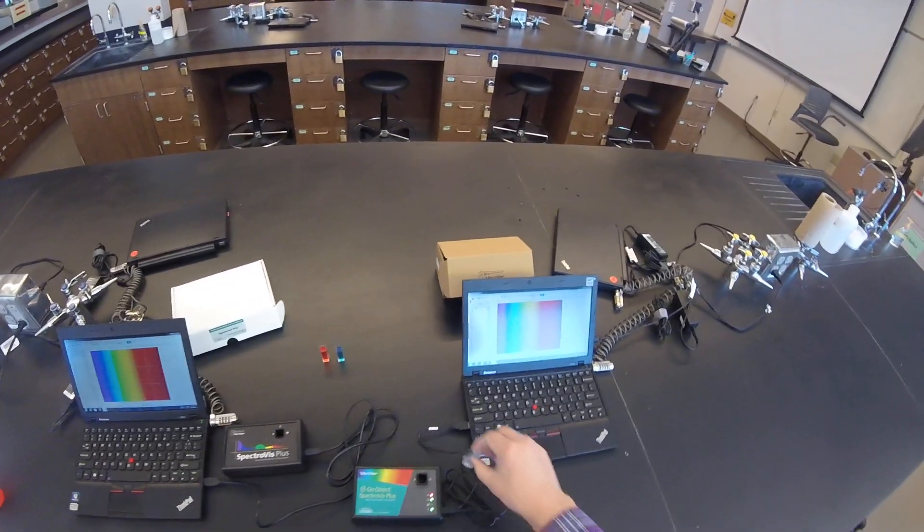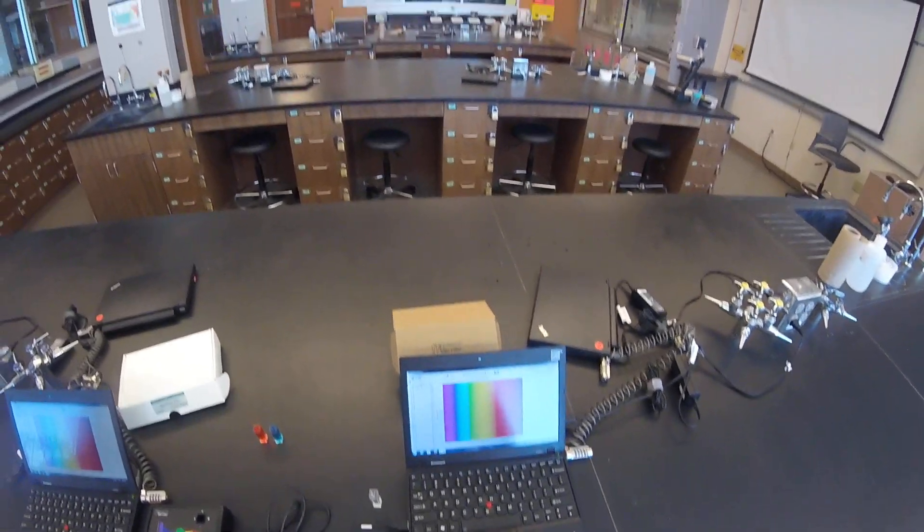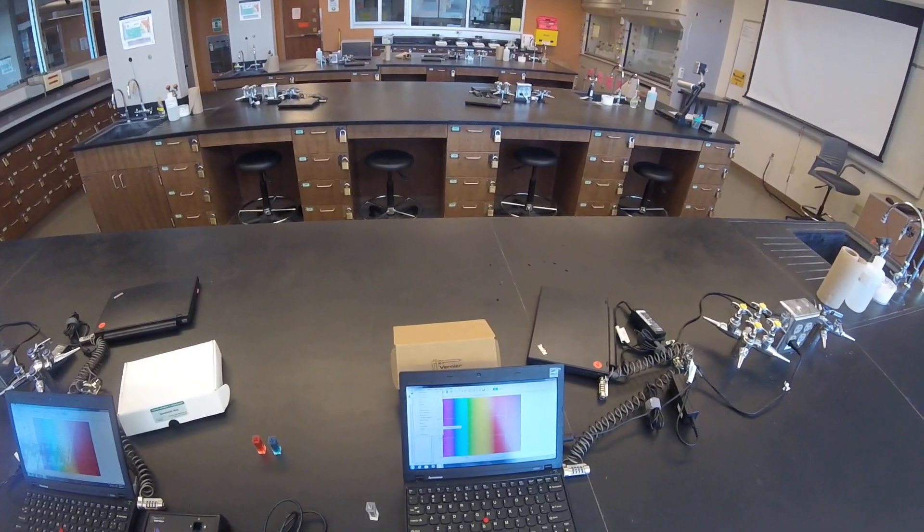Let's pop on over here to the GoDirect. Again, we will go ahead and click Experiment and Calibrate Spectrometer.